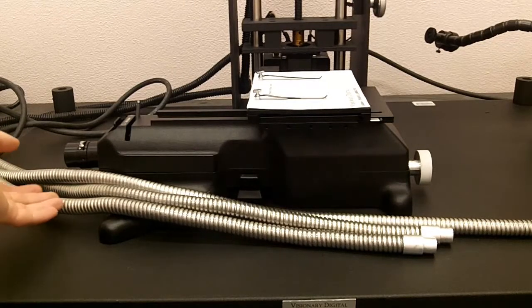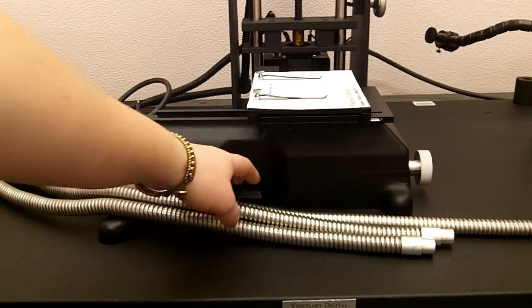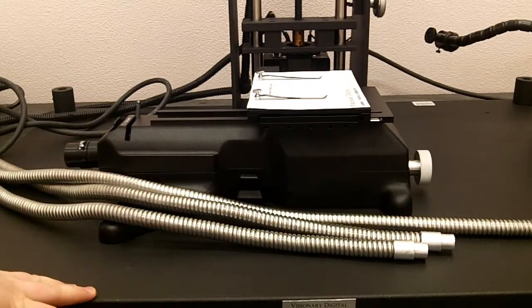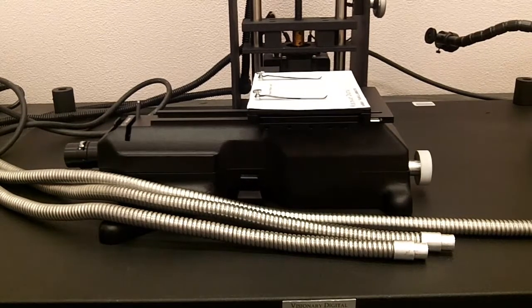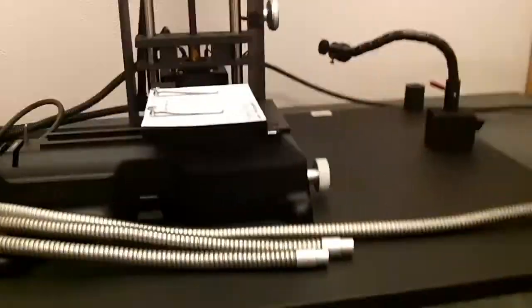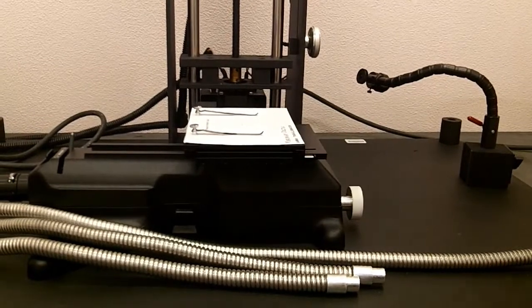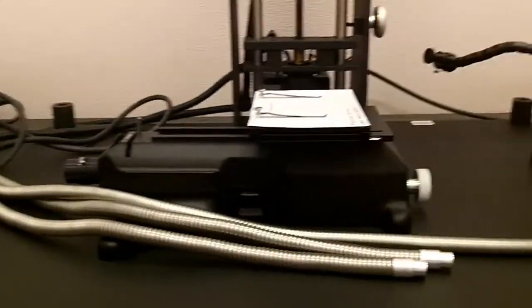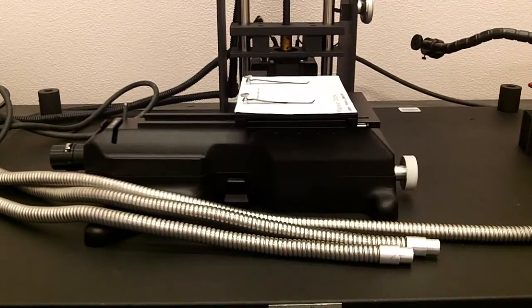So here I have three fiber optic cables, two shorter and then one longer. And generally, I hook up a shorter fiber optic cable with the SolMate. So if you need a fiber optic cable over here, you can use a longer one and it can reach to the right side of the SolMate.